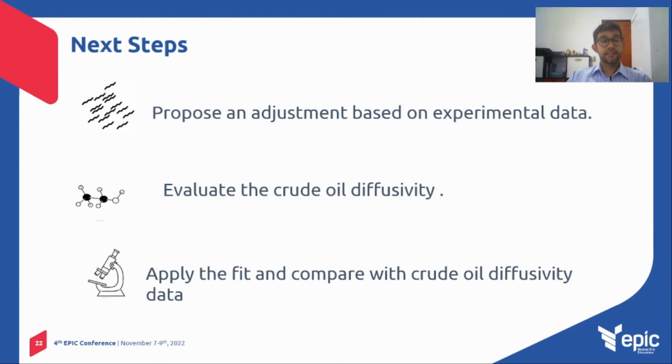Our next step here is to propose an adjustment based on the experimental data, evaluate also the crude oil diffusivity, and apply the fit and compare with crude oil diffusivity data. Sorry.